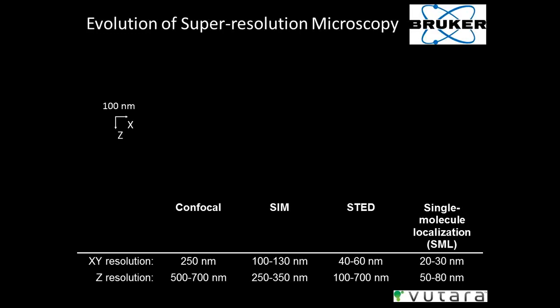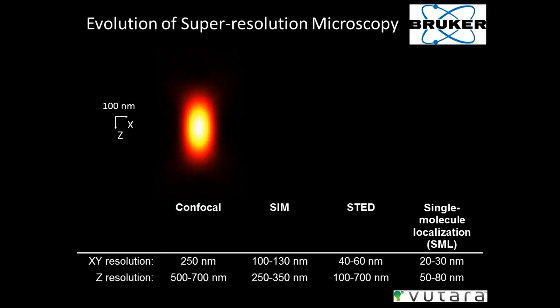One of the main advantages of being able to do light microscopy is that it's non-invasive and you're able to do live cell imaging with that. So in order to combine the best of both worlds, where you're getting the enhanced resolution with EM but still being able to look at live biological samples, three main super resolution techniques evolved, and they're always compared against confocal, especially in terms of the resolution that you can get.